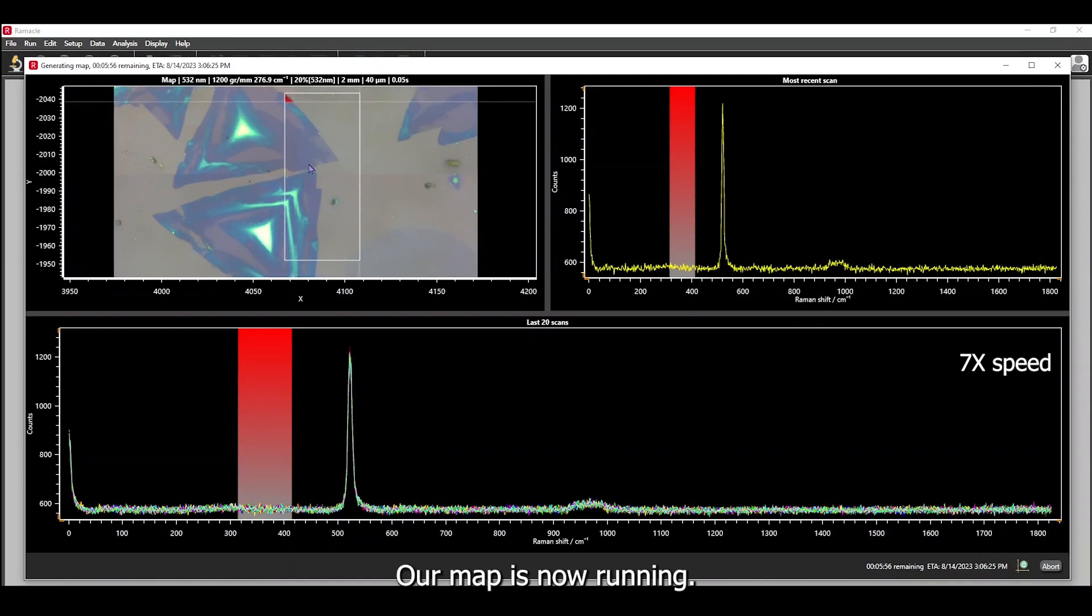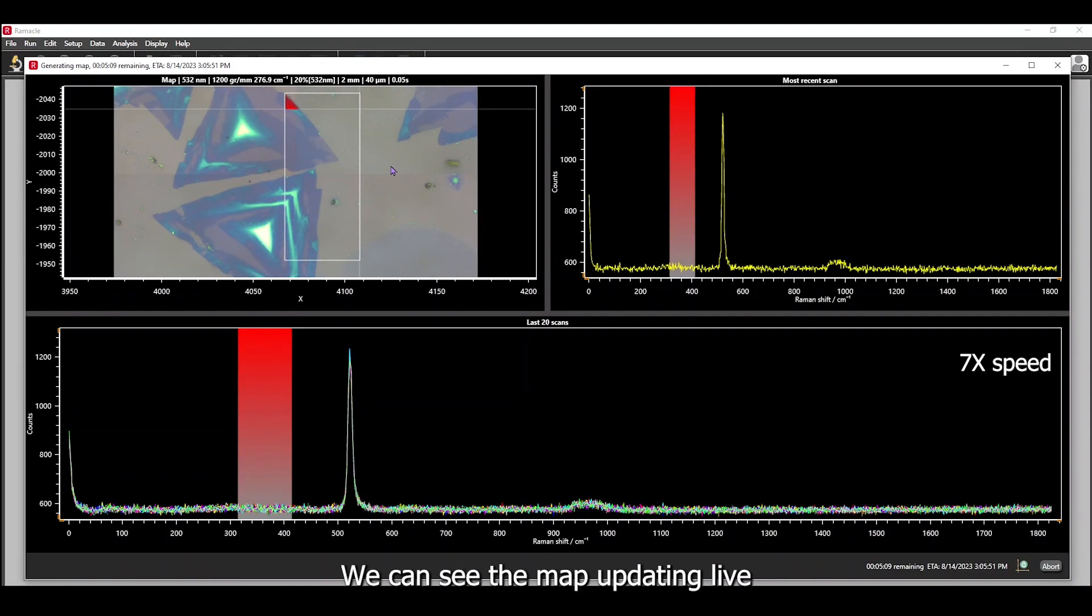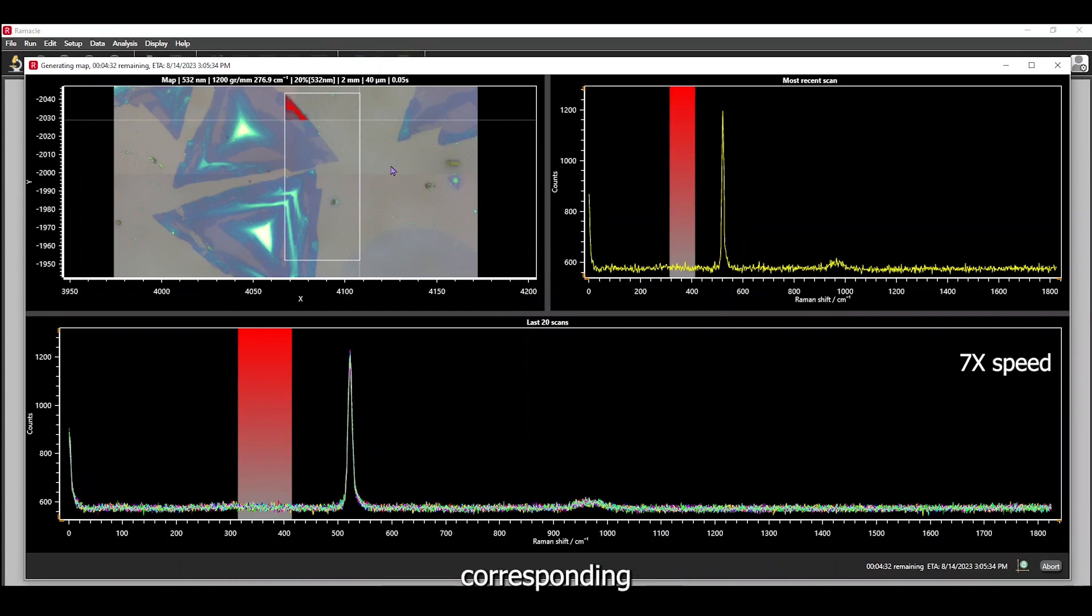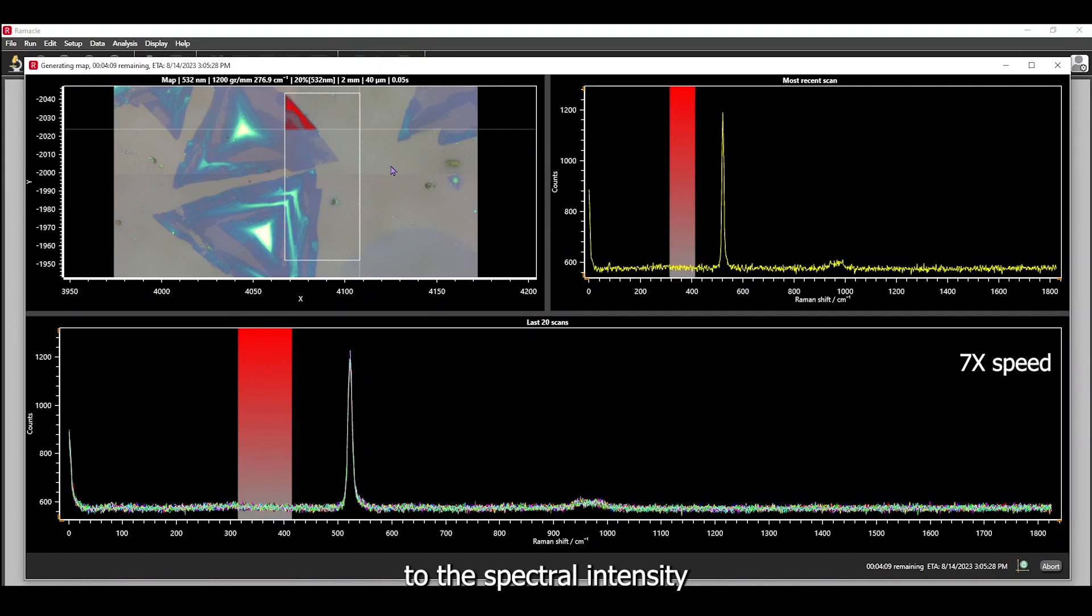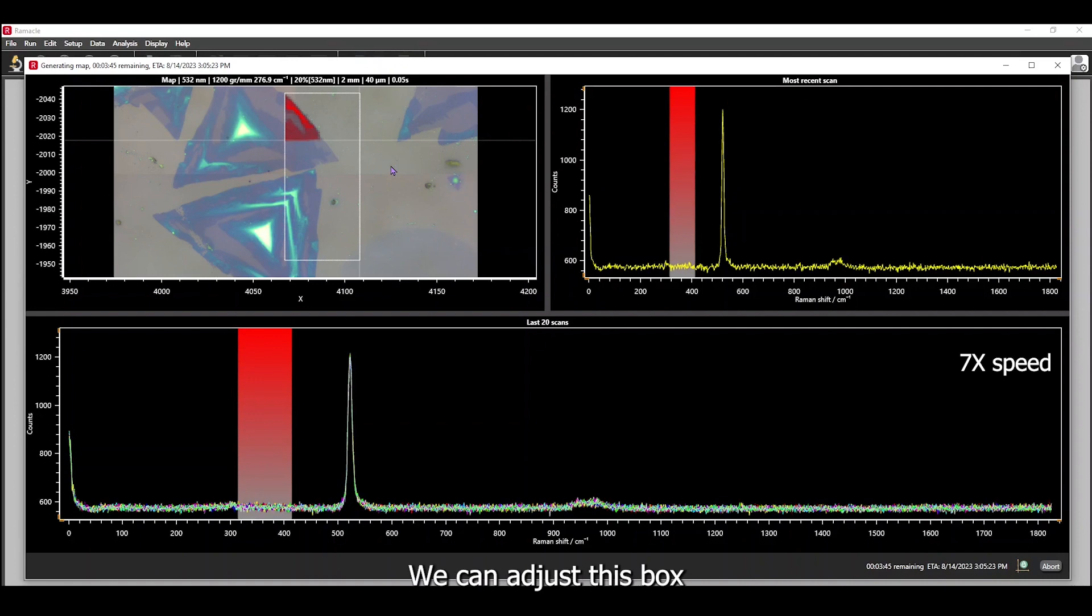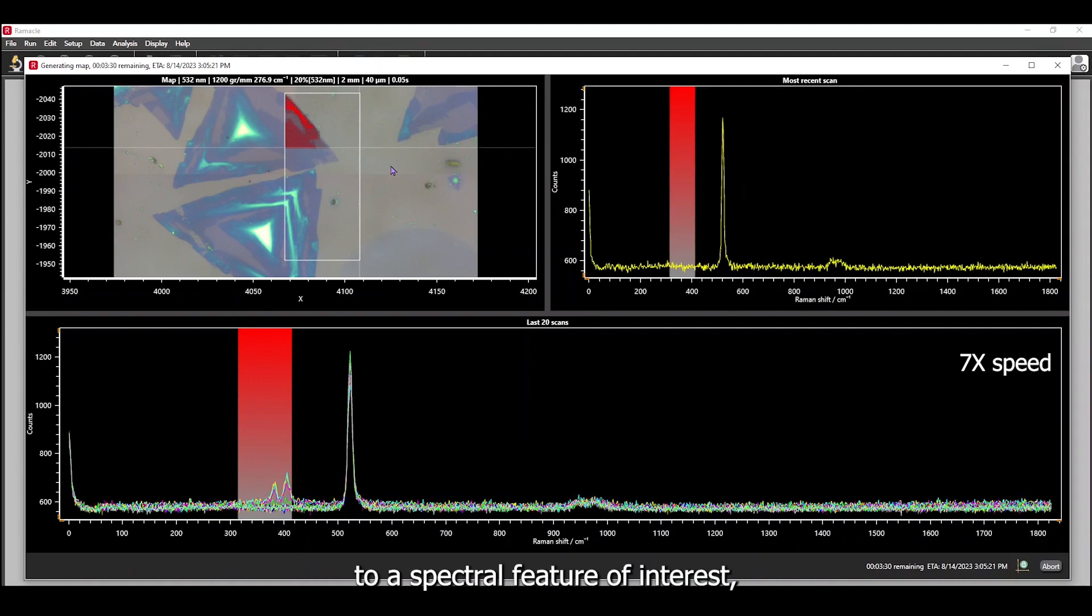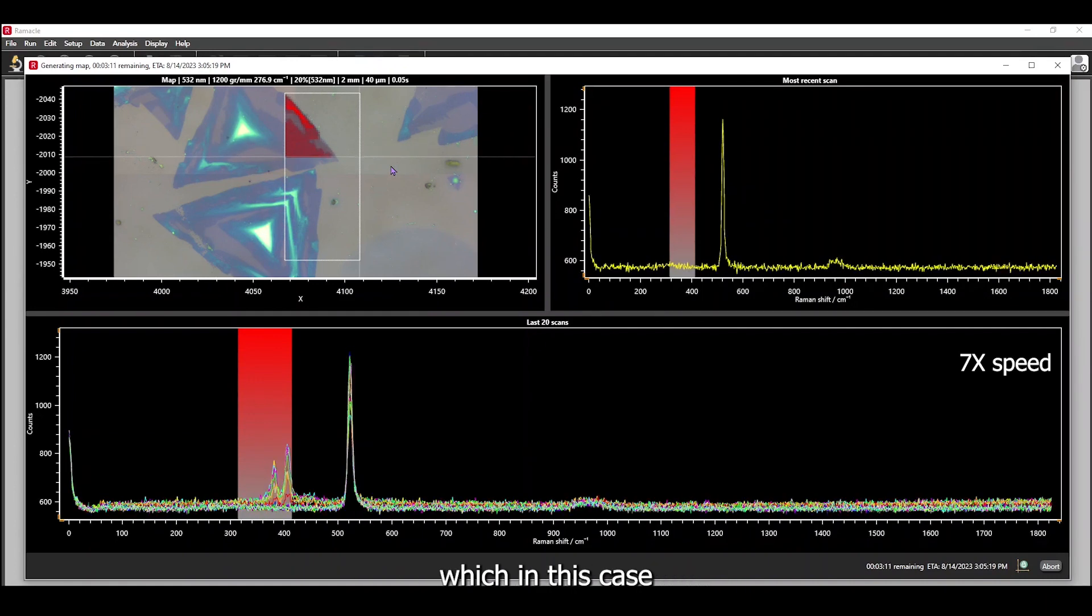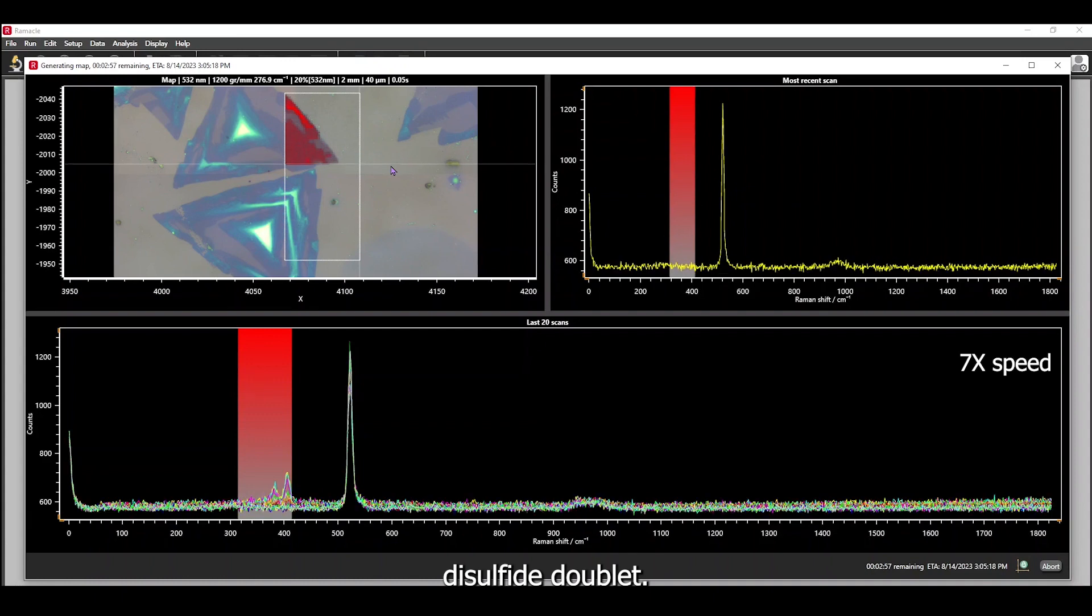Our map is now running. We can see the map updating live with the false color intensity corresponding to the spectral intensity inside the red box on the bottom panel. We can adjust this box to a spectral feature of interest, which in this case would be the molybdenum disulfide doublet.